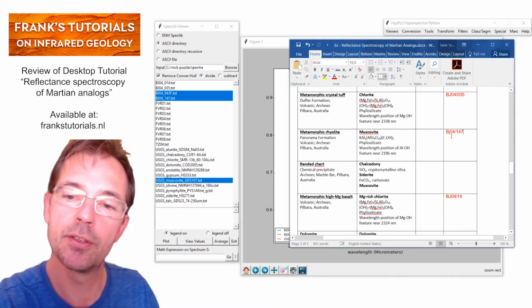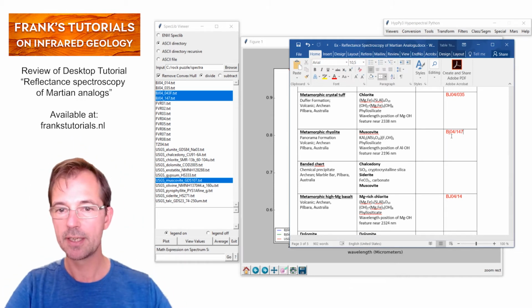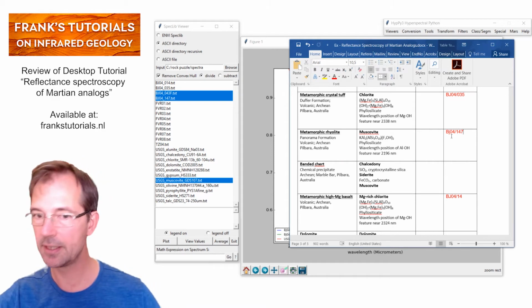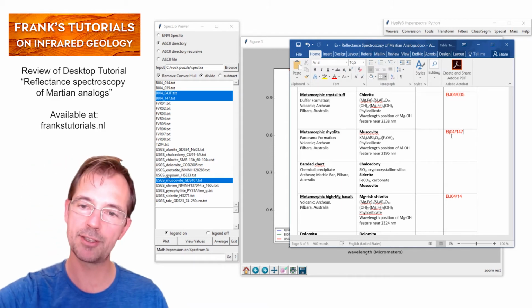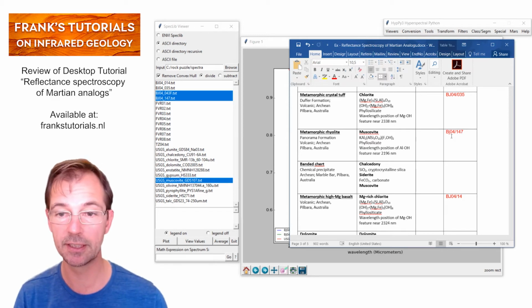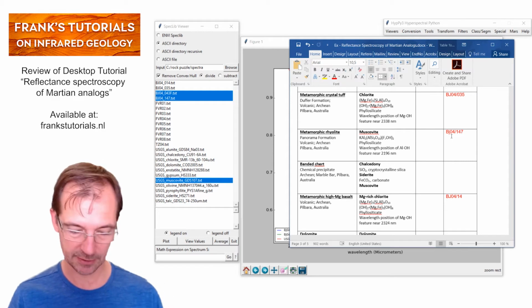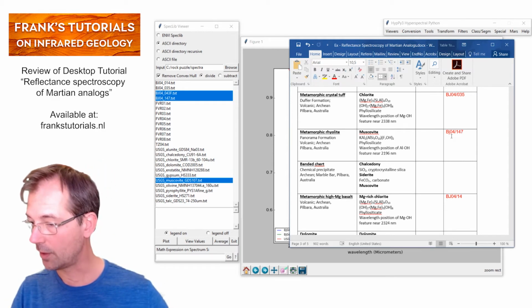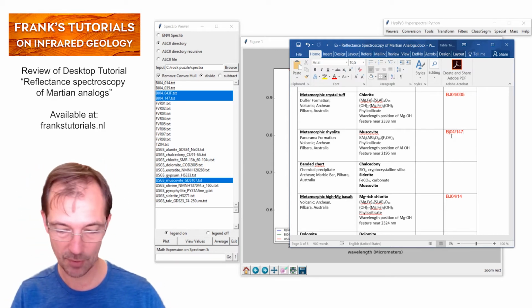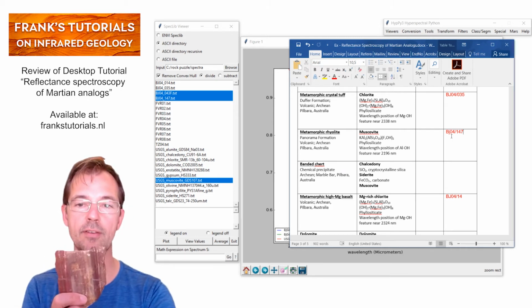Then we continue to another rock, which is a banded chert. It's sedimentary. It's a precipitate from the Archean. It's a mixture of minerals consisting of chert, of course, chalcedony, and there are some other minerals in there as well, like siderite and muscovite. Well, if we look at the rocks, then there's only one banded rock that would qualify as a banded chert.